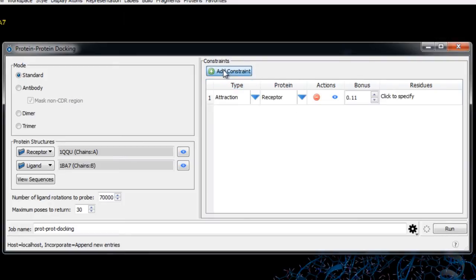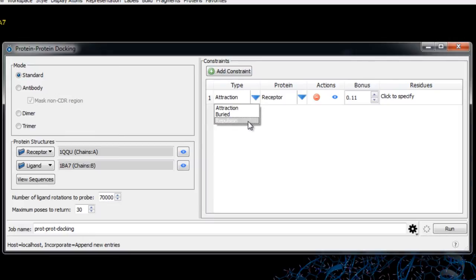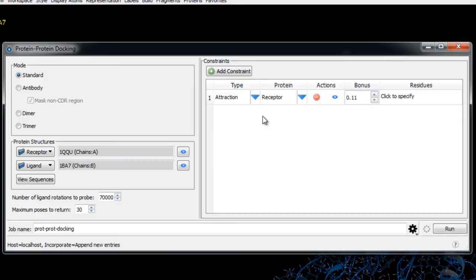In the constraints section we have the option to add constraints to the docking process. For example, you can provide an additional attractive term to the potential, remove the attractive potential, or declare residues to be buried. Constraints are implemented as a bias during the docking process, so they increase or decrease the likelihood of the specified interaction but do not guarantee that the specified restraint will be met by all top-ranking poses.